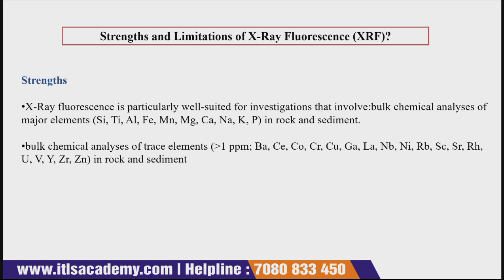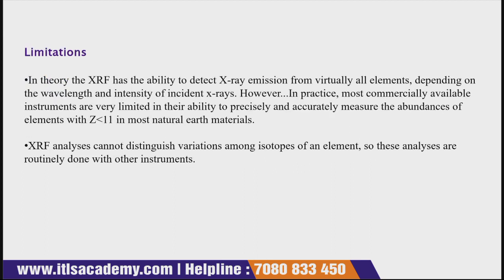Now comes the bulk chemical analysis of the trace elements. Here again you want to analyze the bulk chemical composition of trace elements, for example those that are more than 1 ppm. So basically there also this type of fluorescence spectroscopy plays a very major role.